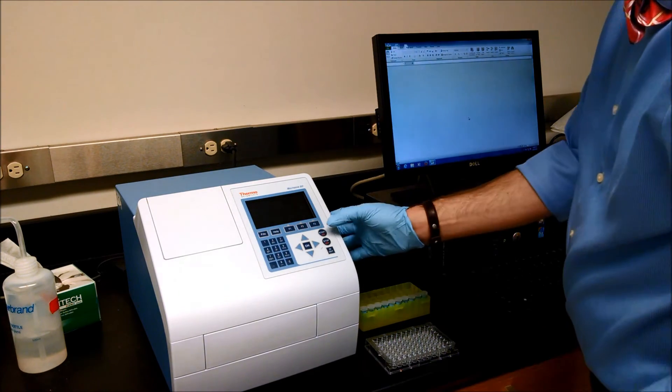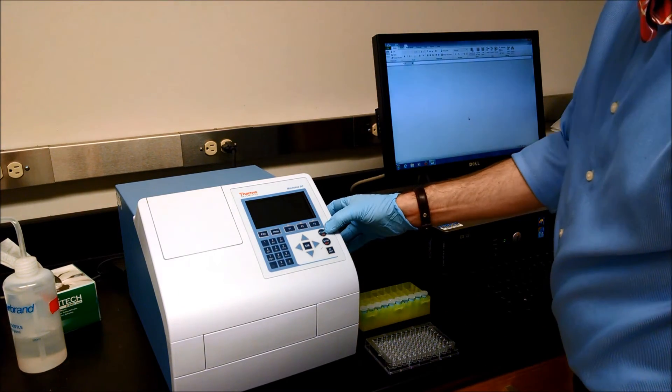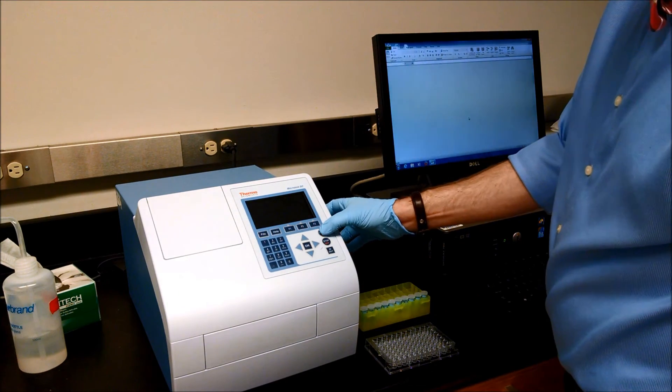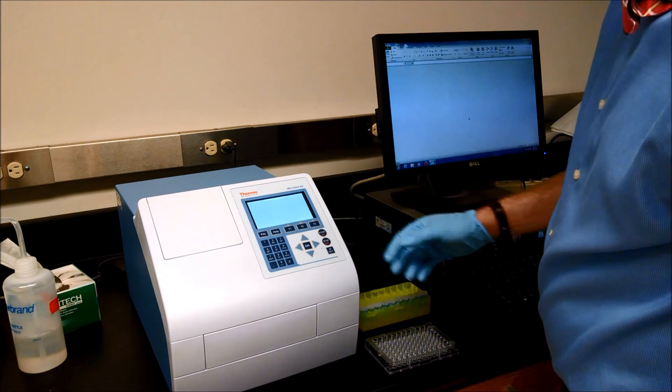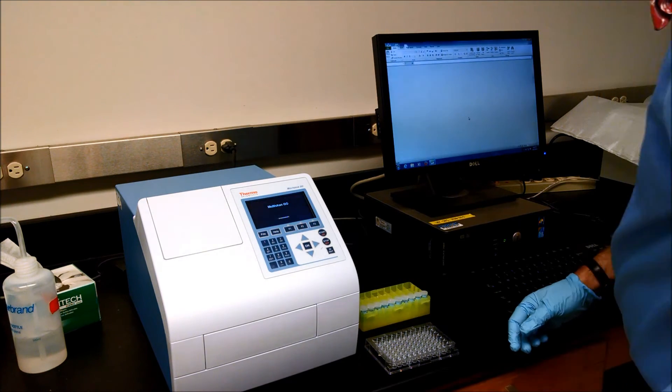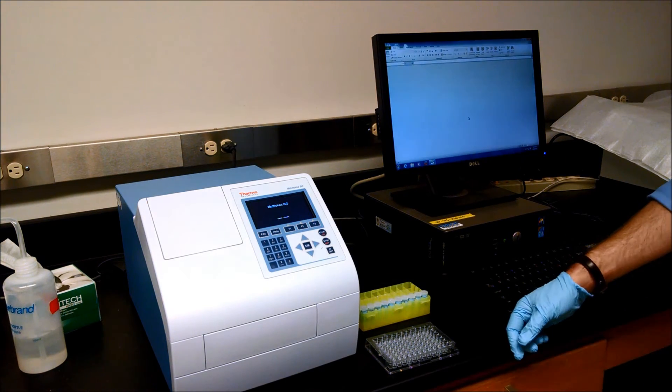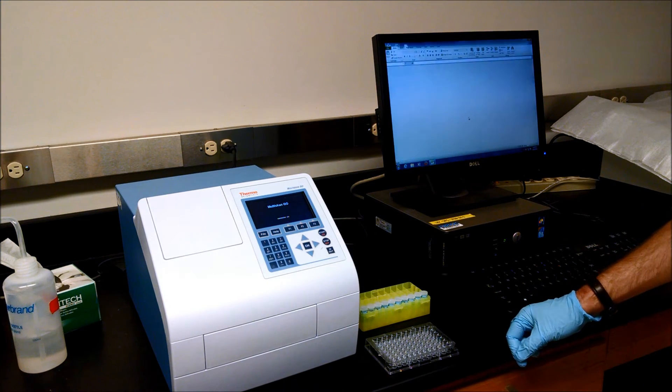Turn on the instrument, press this button where it says start on, and it will go through a warm-up routine.